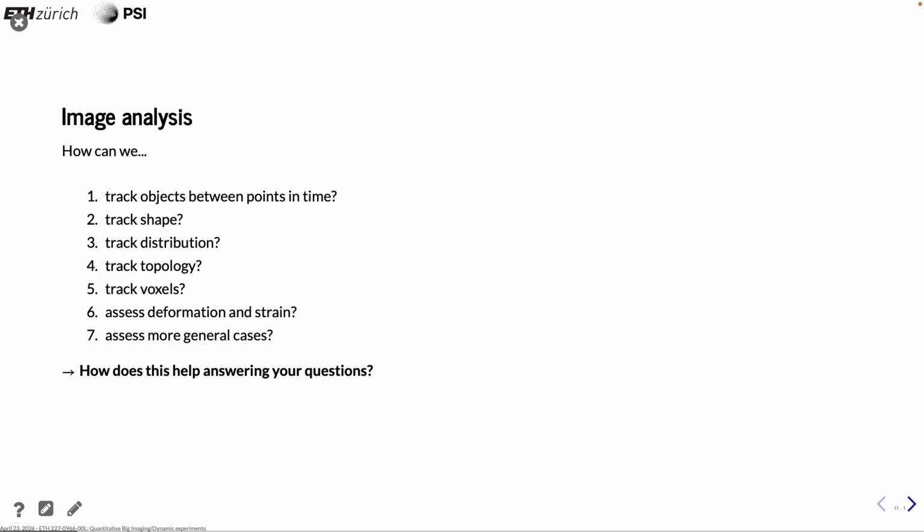We can actually start already from the beginning. So often the images, when you do rapid acquisition, are definitely noisy. So you need probably some kind of denoising, or at least noise-robust techniques. Next thing is, it would probably help to do some labeling.